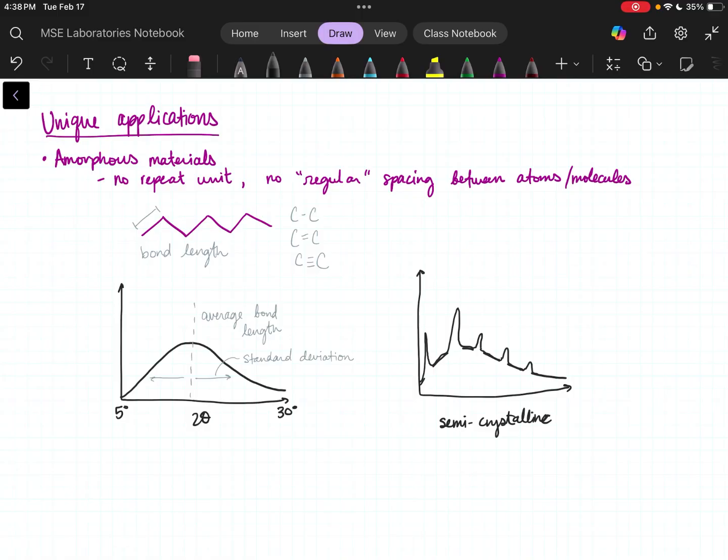So we're going to have this sort of combination. The amorphous hump is what we call that. It's not going to hide the crystalline peaks, nor will the crystalline peaks hide the amorphous hump. It's just literally additive. Gotcha. The curvy background can make it a little bit harder to read where exactly a peak starts and stops, but still that can be kind of corrected for.